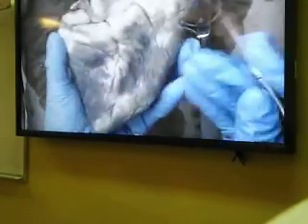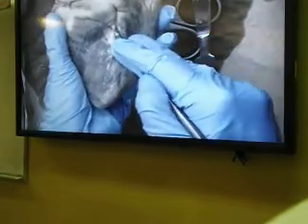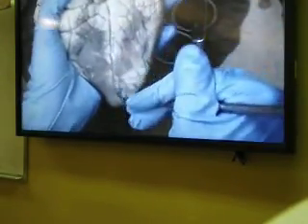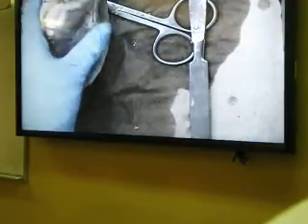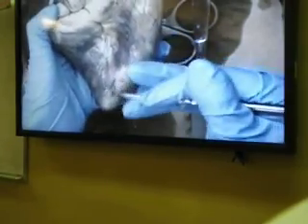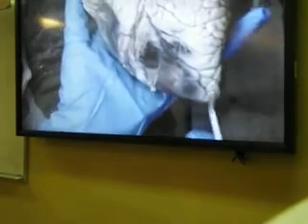I'm going to the posterior aspect. This is the posterior interventricular sulcus, which is going to end almost close to the apex. In some hearts it's a little bit better to see. This is the posterior interventricular sulcus going almost to the apex. This is the apex, and here same thing, the posterior interventricular sulcus ending almost at the apex, but the anterior interventricular sulcus is anatomically right of the apex.